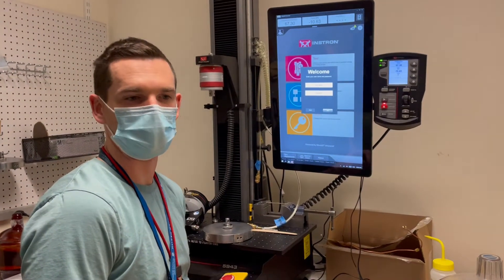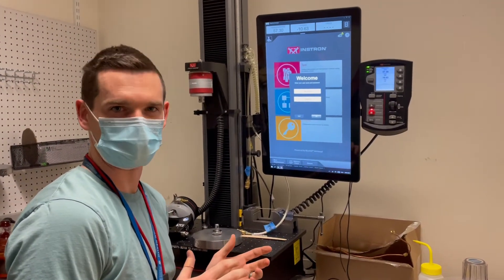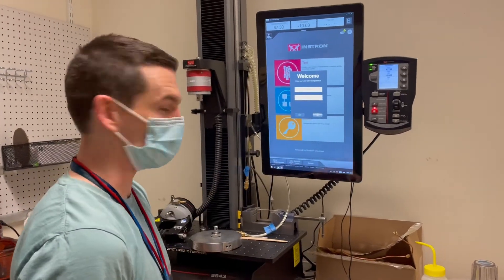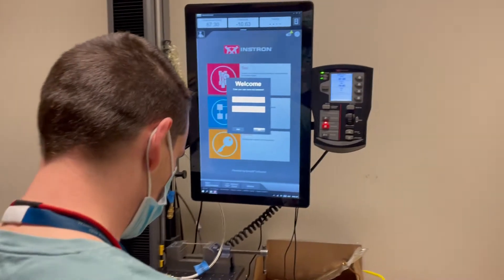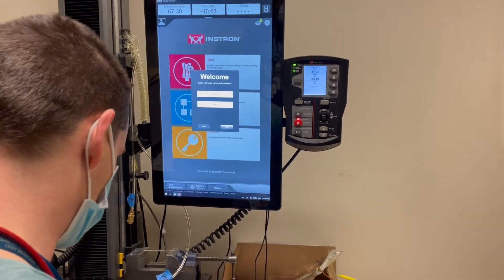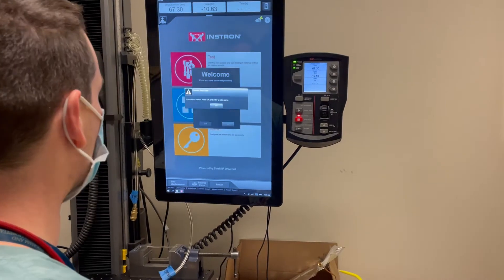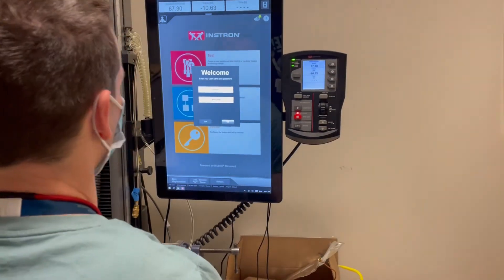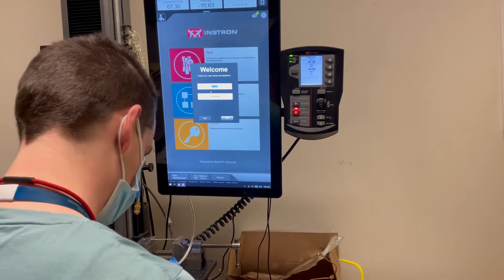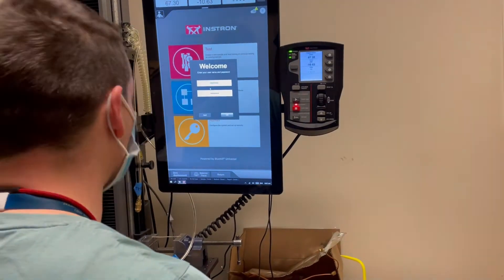This training is an introduction to the Instron, which is a mechanical testing device. The first thing you'll have to do is log in, with username Instron and password Instron — all capital letters for both: I-N-S-T-R-O-N.